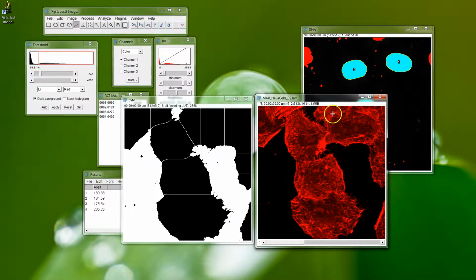It's obviously very difficult for a computer to distinguish these. We can pick up the patterns, but based on intensity and without intelligent inferences from the shape in these algorithms, you can't really do much with it. So this is what you get here from separating out just the basic 3 cells down the middle here.